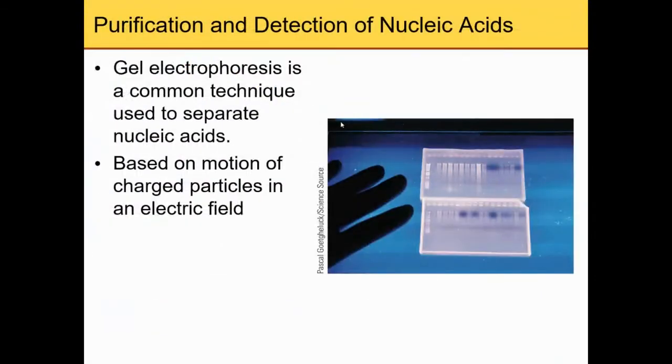Chapter 13, the older technique, okay? So first of all, the nucleic acid. To identify and to visualize the DNA, it's very easy. So you need to run the DNA.